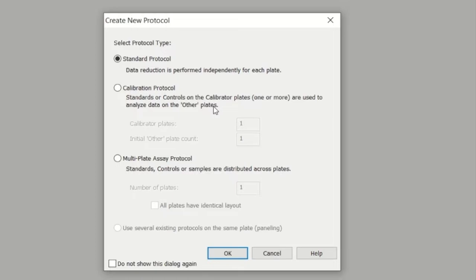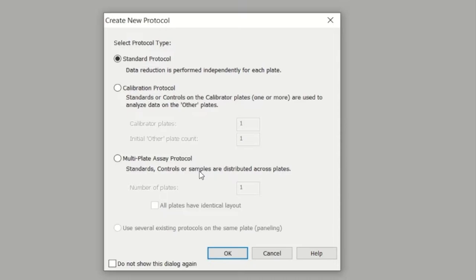Alternatively, you can pick a multi-plate assay protocol. This involves the standards, controls, or samples being distributed across multiple plates. When it comes to handling the data, if you select a multi-plate assay, this is factored in. For this example, just go ahead and select a standard where each plate will have its own independent data manipulation.